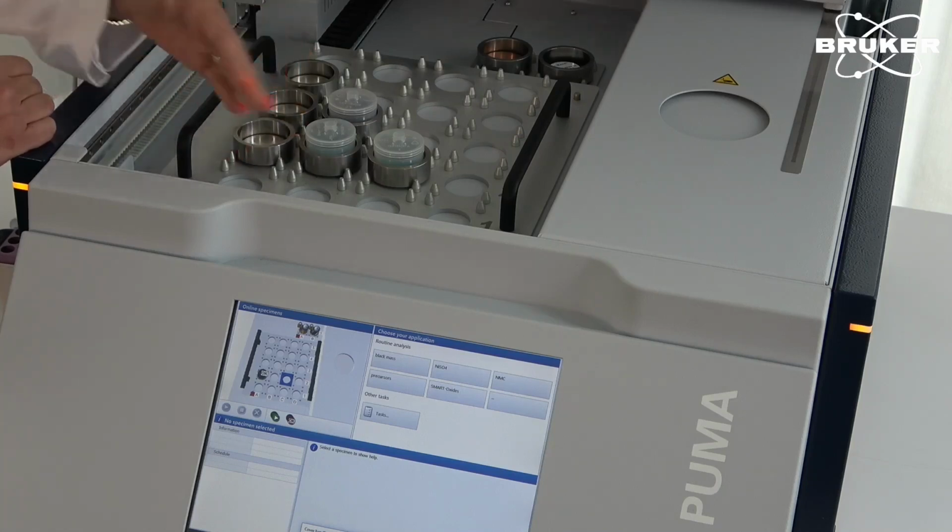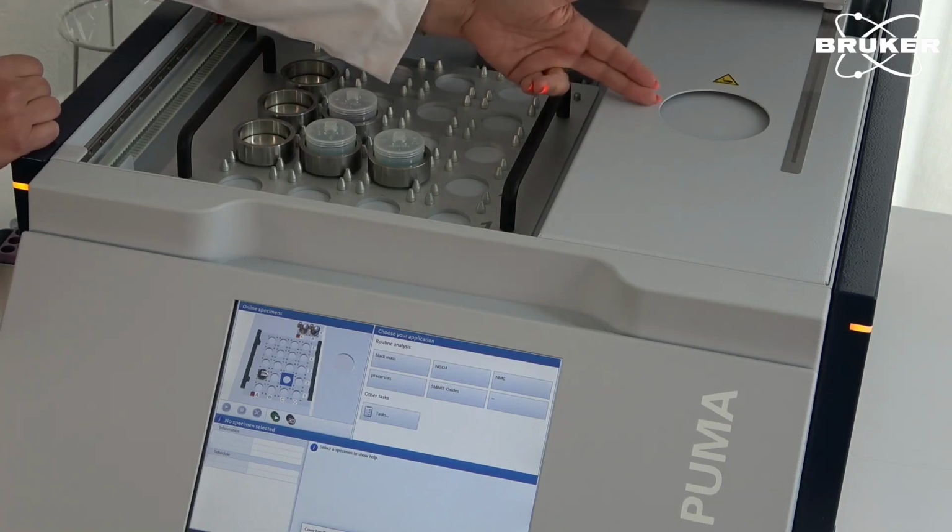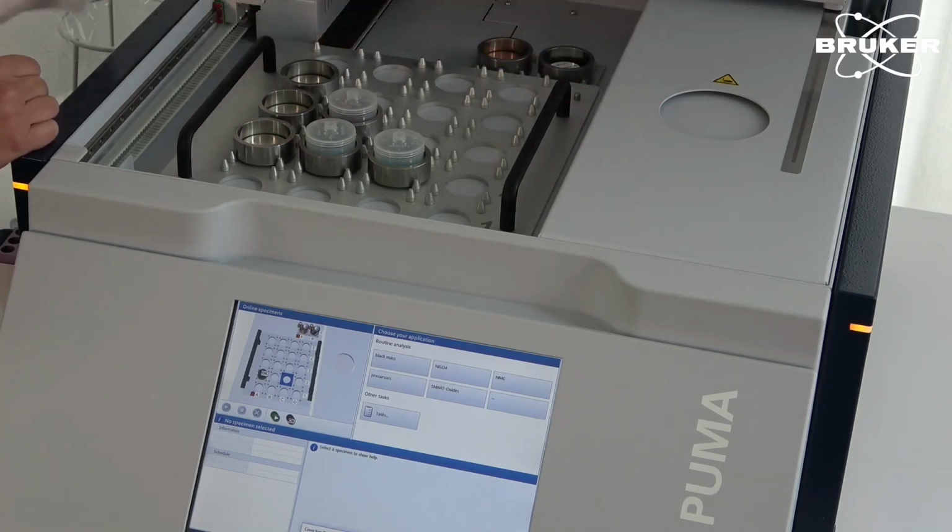The samples are loaded in this area here. There is a grabber. The grabber will pick up the sample and will load it into the measurement position. As long as the sample is running, you can open and close the lid, you can load and unload samples, so this is a very flexible system.